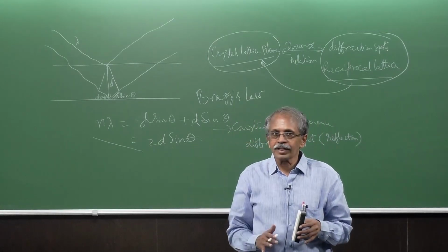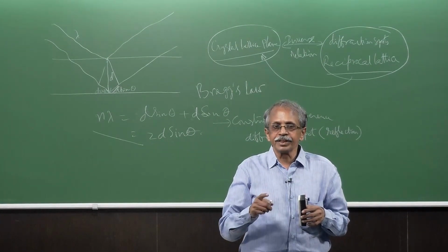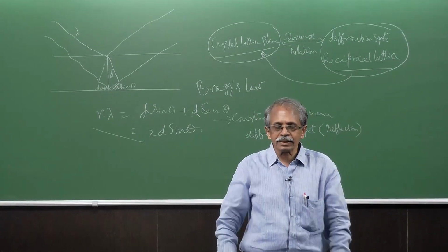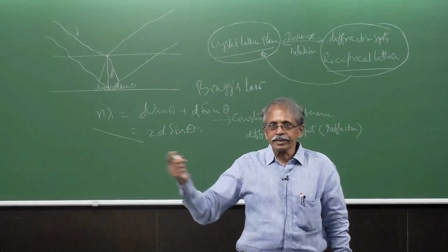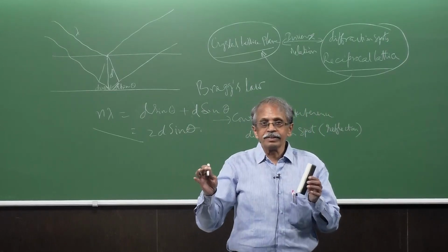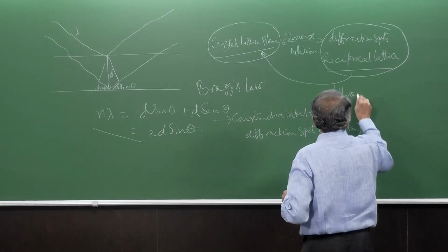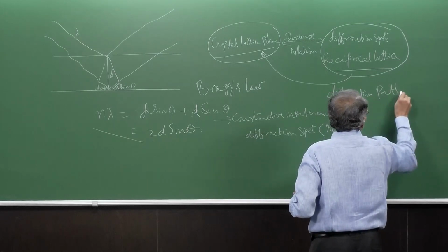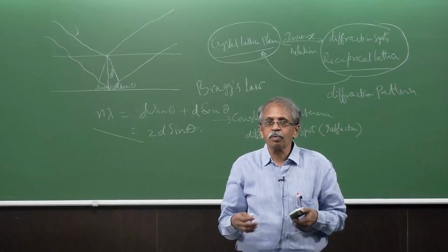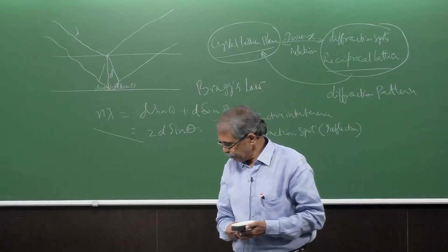So just like light diffraction, in X-ray diffraction each atom, having electron density, will scatter the X radiation, and the scattered radiations will overlay, constructively or destructively interfere, and result in the diffraction spots, which are also called the reflections. And there is a pattern found in the diffraction spots. It is called the diffraction pattern. Using such a pattern and using certain mathematical relations which will not be a part of this course, you can reveal what the lattice is. That is how you get the things.